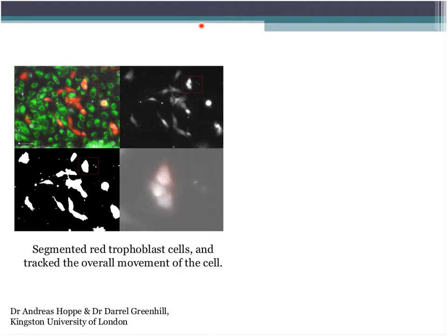And also when we think about it in terms of trophoblast plugs being in there, and the shear stress being quite low in the first trimester, I wanted to look at this process and maybe provide some direct evidence for it, or look at how it might be occurring and how shear stress may affect this process.